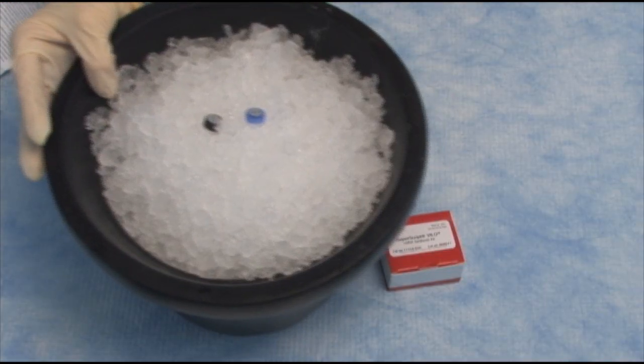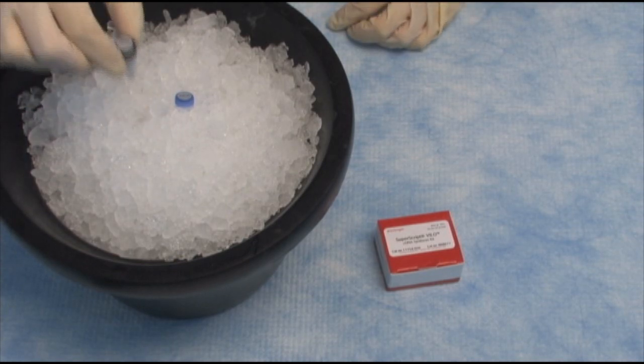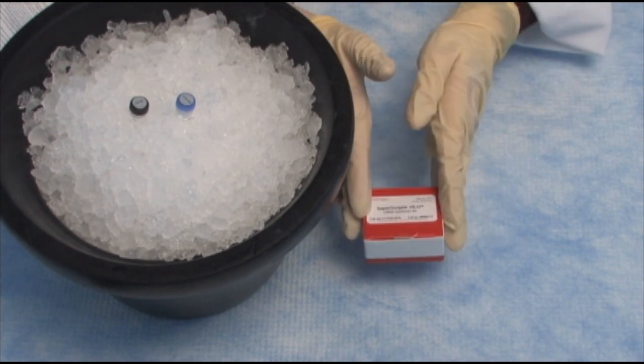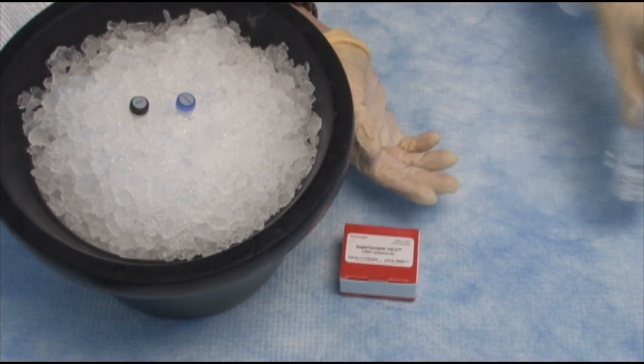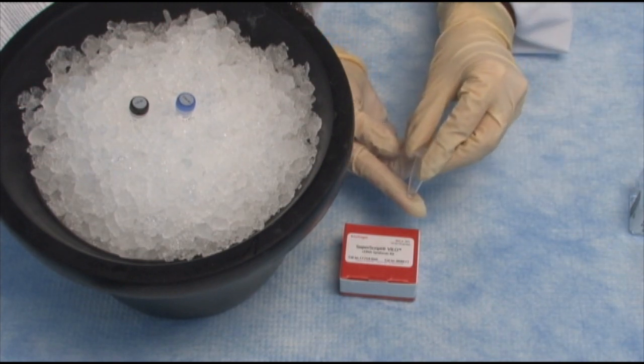Here's how it goes. We are going to need four components: your 10X Superscript mix, your 5X Velo mix — both provided in this kit — some RNase-free water, and your RNA sample. That's it. Mix these four together and you will end up converting your RNA into cDNA, ready to go into real-time PCR.